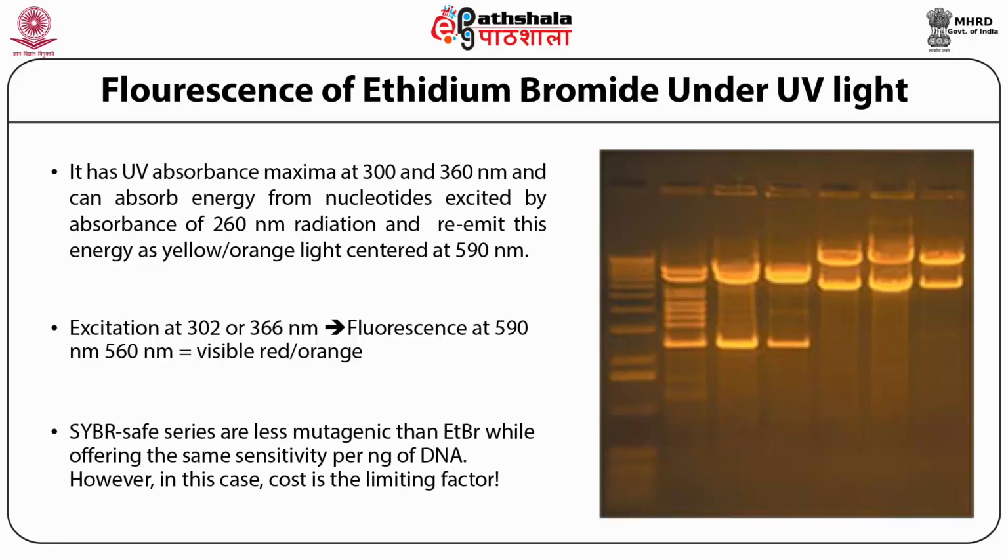After insertion into the hydrophobic core of the helix, the ring system makes contacts with the base pairs in the vicinity and lies perpendicular to the helical axis. The intercalation of ethidium bromide into the helical axis leads to about a 27% increase in the length of the double-stranded DNA.